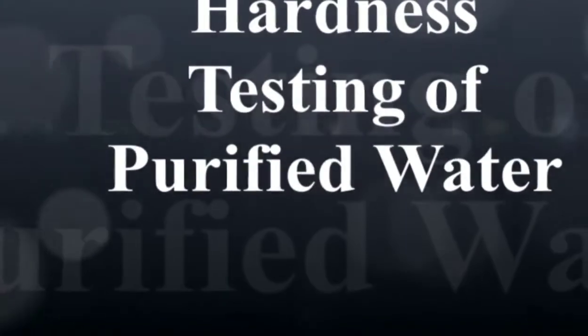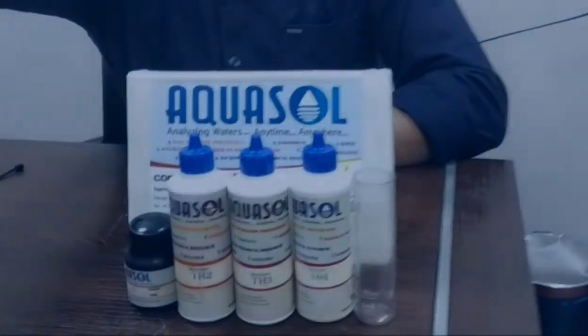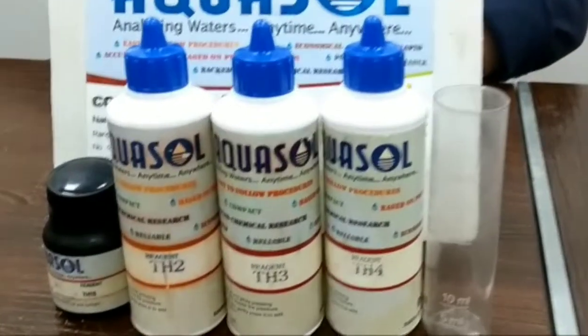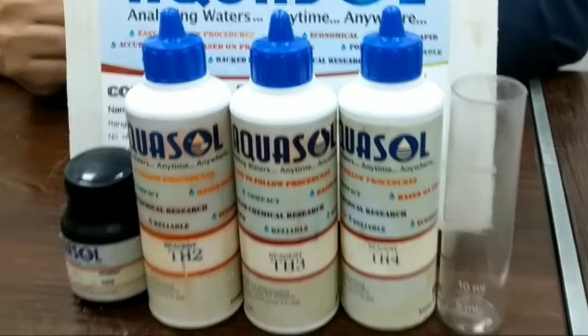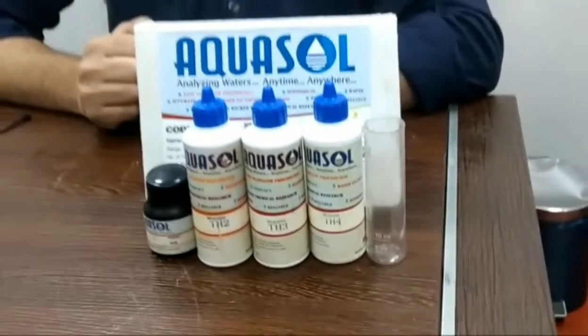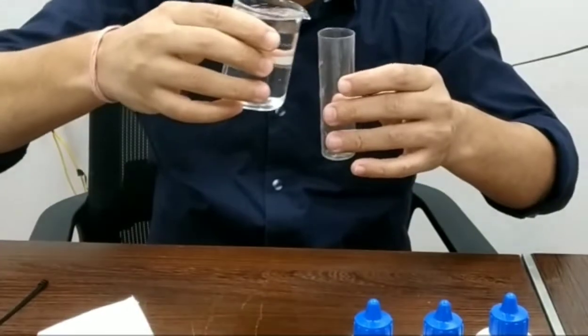Hello friends, welcome to my YouTube channel. Today we are going to test the hardness of purified water as well as raw water. We have the hardness test kit here — you can see all the reagents used for testing hardness: TH1S, TH2, TH3, and TH4. Let's start the testing.